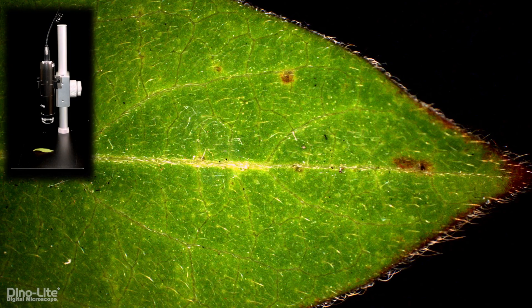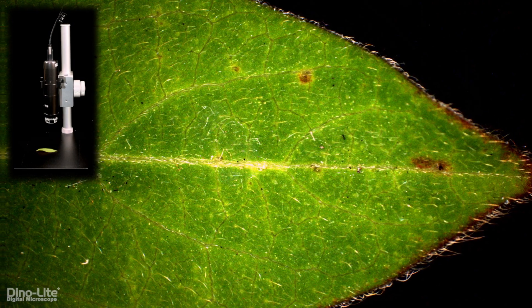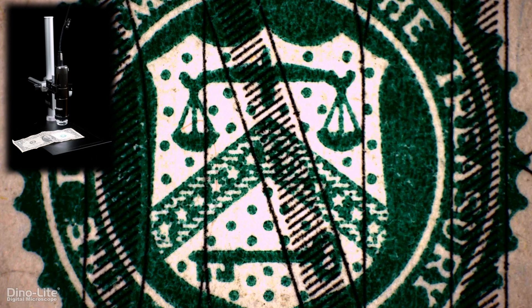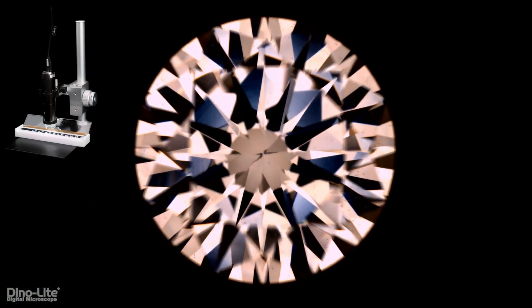Each 8MP scope carries a camera capable of capturing images and video at 4K resolution and 16 by 9 aspect ratio with our new DynoCapture 3.0 software.